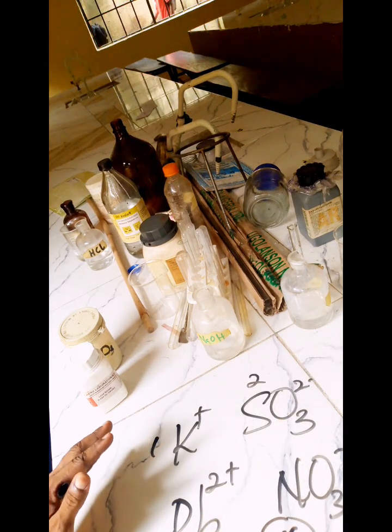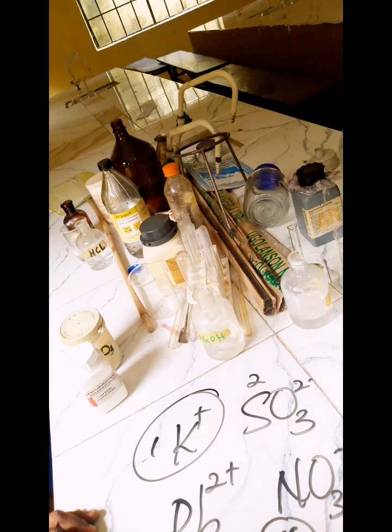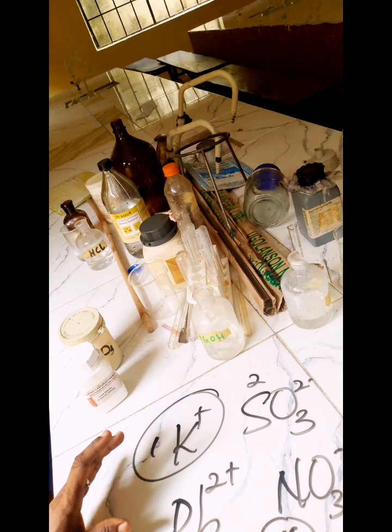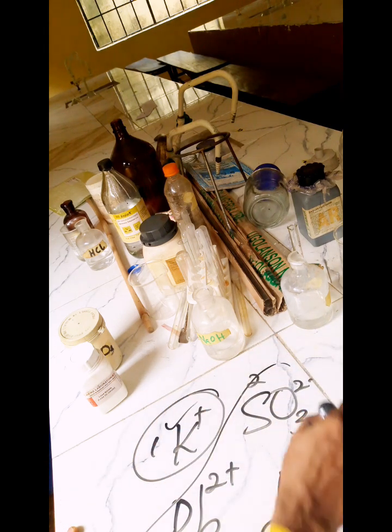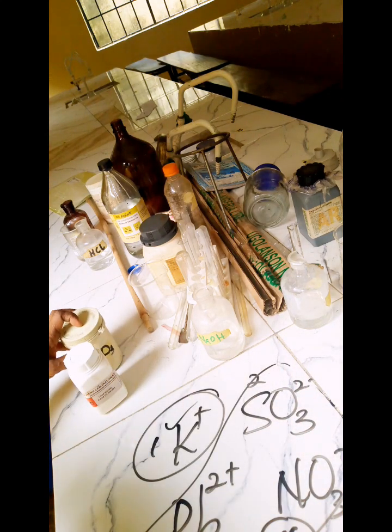However, there is no special reagent to identify potassium other than the flame test. So we use the flame test to identify the potassium ion, then reagents will be used to identify the other ions. Let's begin with the potassium ion with the flame test.